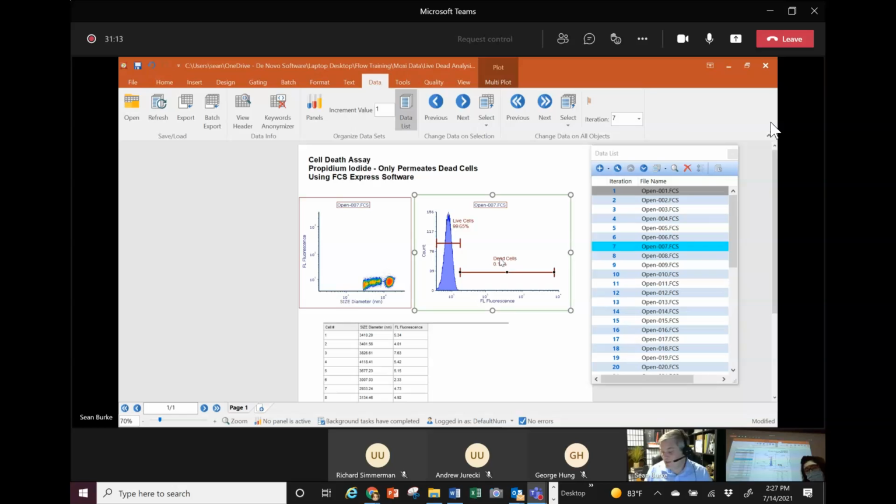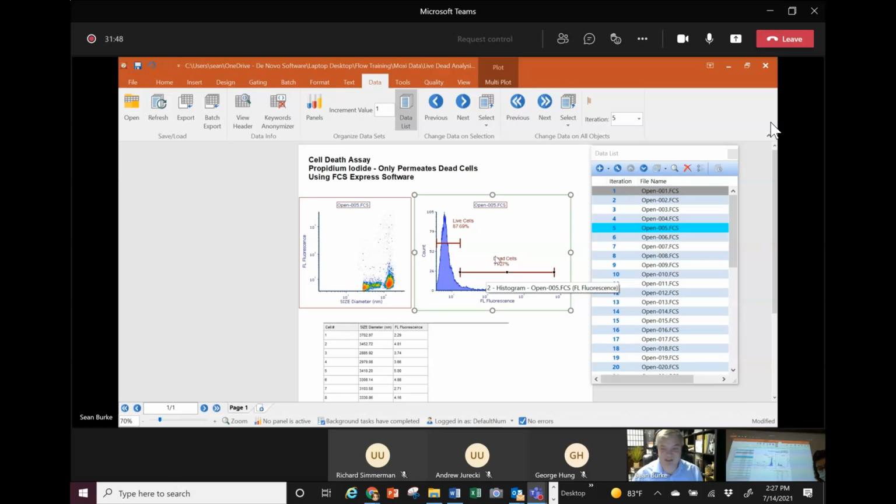So, what happened with that sample, right? What did we treat it with to get cells to live, right? If you're doing an experiment, you want to cure cancer, well, you want to kill cancer cells, right? You want cancer to die, and you want more dead cells over here. But if you're doing some other experiment and you're looking at maybe immune cells in your blood, well, maybe you want those immune cells to live, right? So you want to make sure that you're running your experiment so you can determine how many of those cells live. So this information isn't giving you one piece of empirical information here. It's just telling you what's live or dead, and depending on the experiment that you're doing, it's up to you to interpret what's going on there.